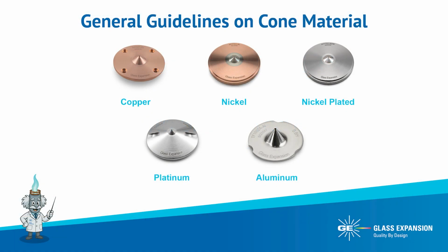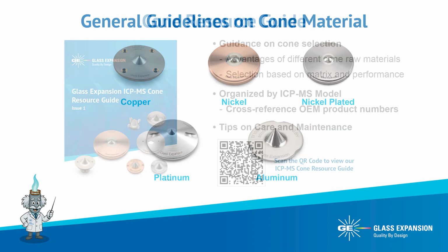Plasma Professor here, and today we're focusing on the material of your ICP-MS cones. For most ICP-MS instruments, you may have several cone options to choose from. Today I will summarize the characteristics of each cone material so that you can use these as general guidelines to select the best cone for your application and analysis goals.